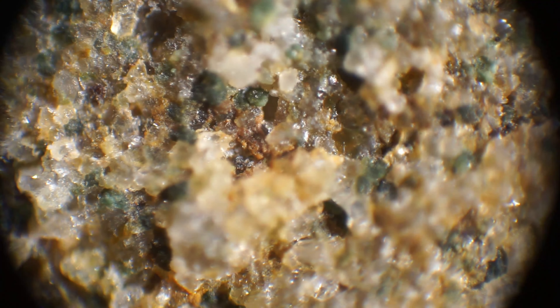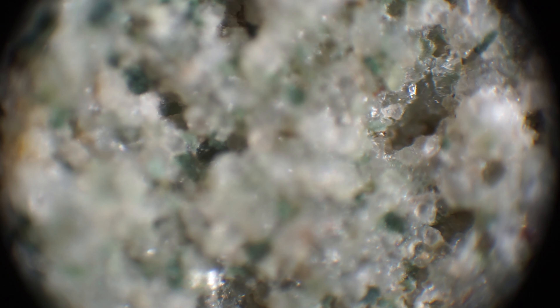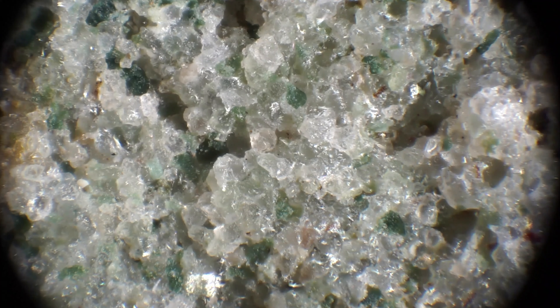Let's see if we can find ourselves some other place on this stone to take a closer look. Let's make a stack of this area. Here we got the result and after some editing we got this one. And if someone knows what the green is, just let me know in the comments.